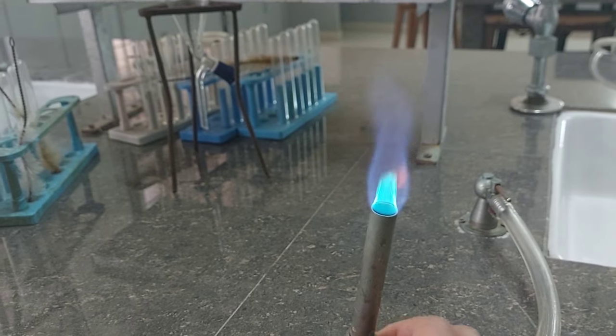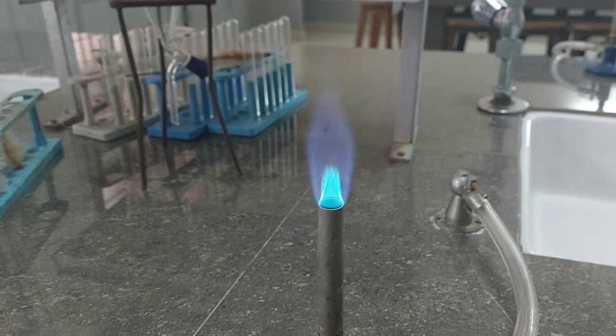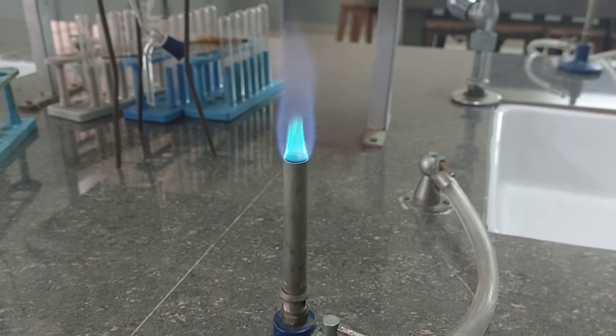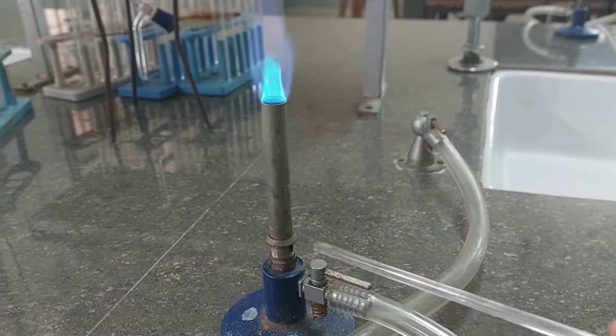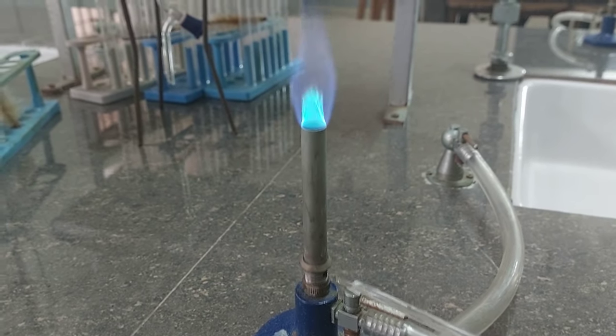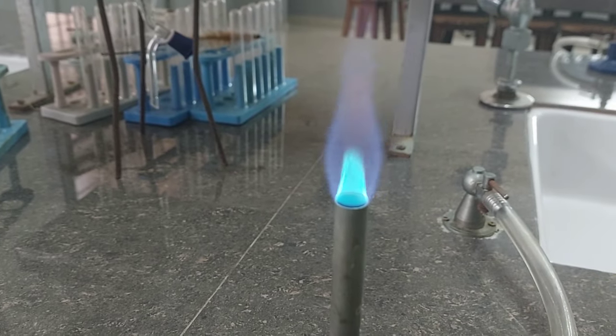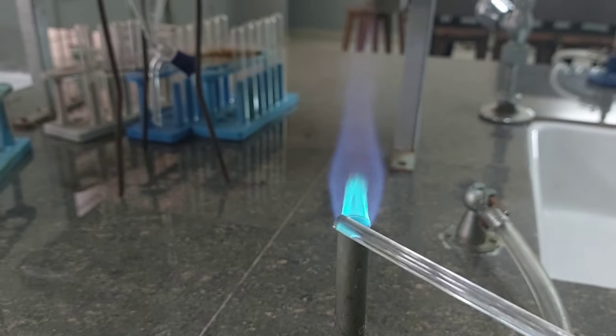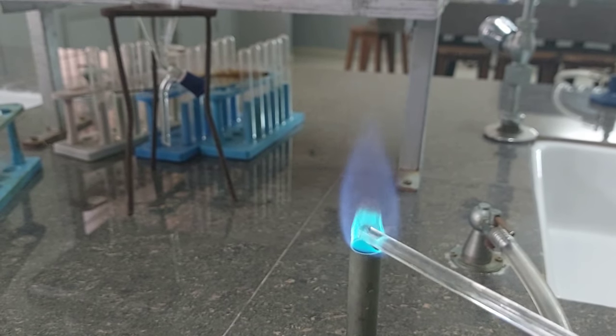Now what are the main zones? This is with excess oxygen allowed to pass through this hole. So two main regions you can observe in this flame: this is the blue part and this is another violet blue color.